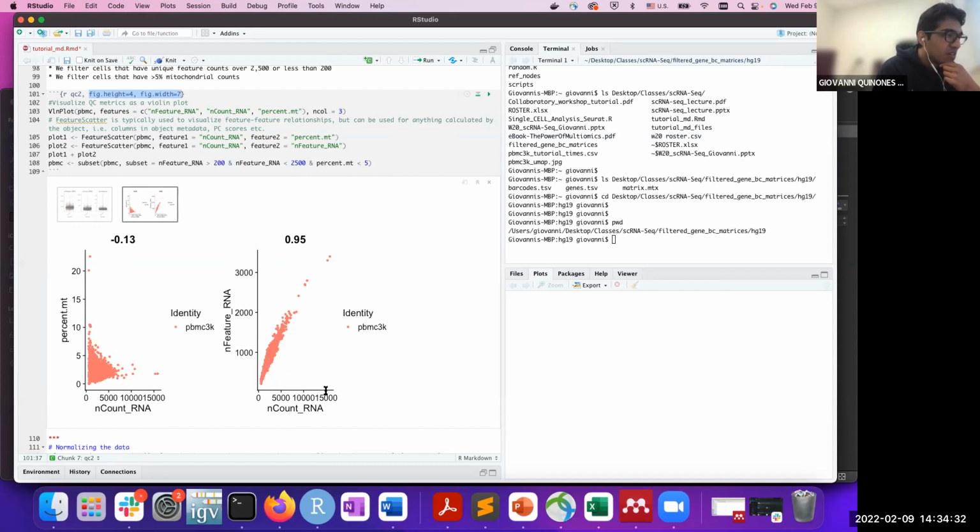If you look at the values, the top value here is around 3000, and here the top value is around 15,000. So what you can tell from this plot is that there is a tendency of an average gene being covered by roughly 5 reads.